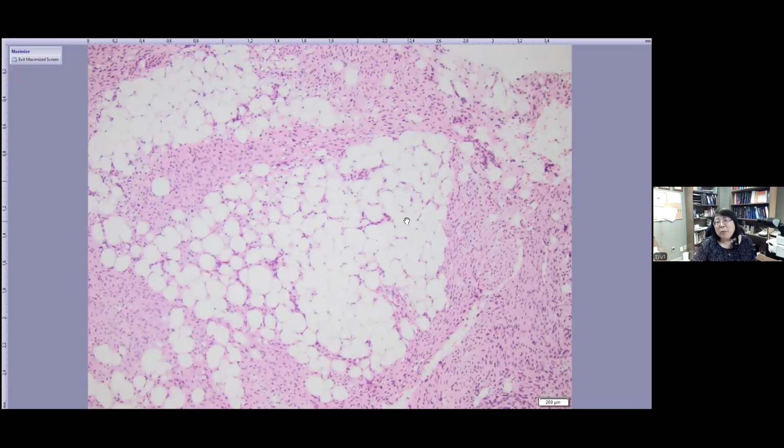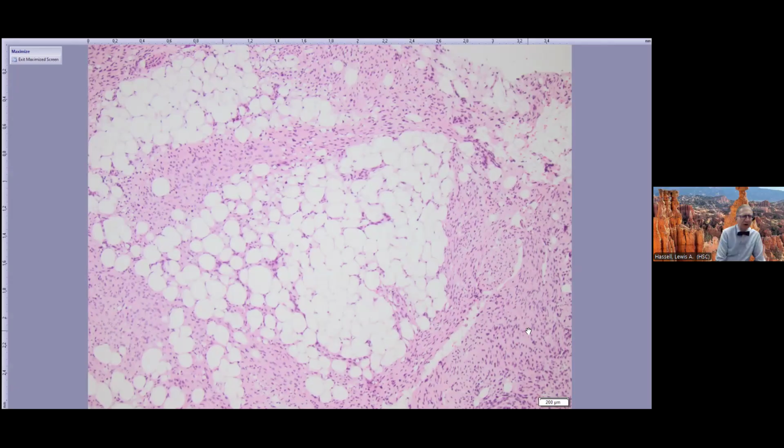Yeah, lipoblastoma: anytime you see those vacuoles, you worry about lipoblastoma. Lipoblastoma usually does not have this prominent fibrous septa. They usually have thin fibrous septa, not this biphasic, almost half-and-half kind. What about differentiation from, say, a spindle cell lipoma? CD34 is usually negative. Okay.